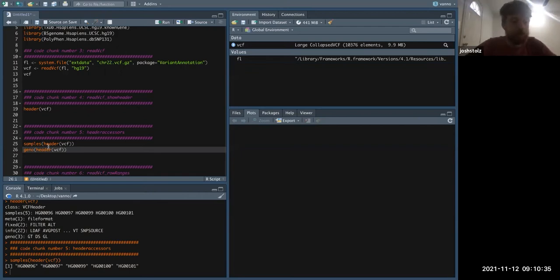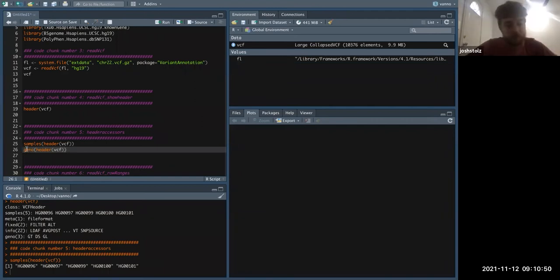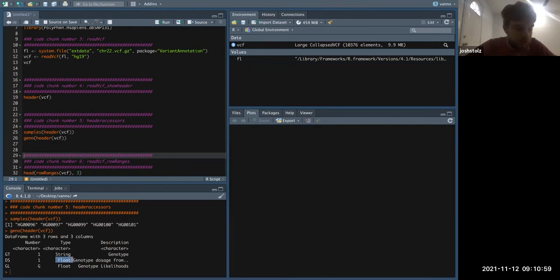The geno function comes back to this geno field and allows you to access it as its own object. We can look at the data types: string, float, float. Each has a description here.